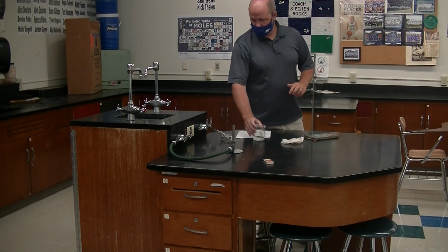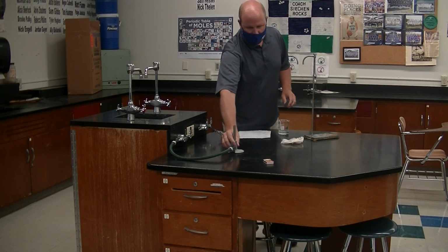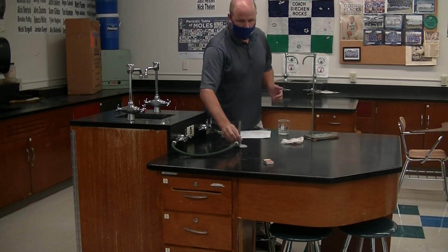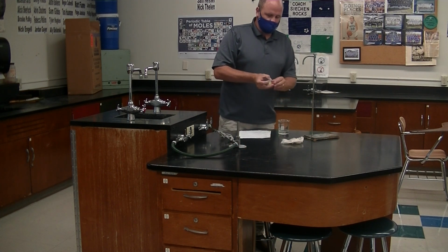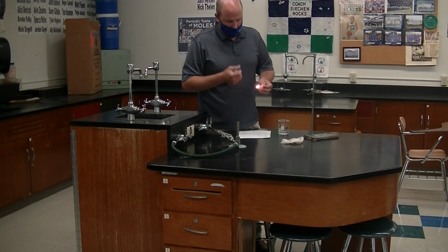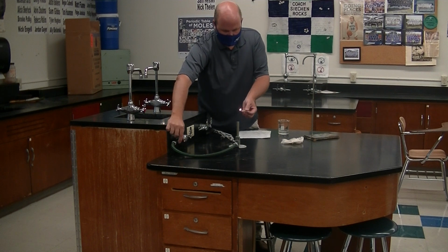All right, and then what's this called? A beaker. Have you ever seen one of these before? No? This is called a Bunsen burner, and this is our primary heat source. We will use hot plates at times, but lots of times we use Bunsen burners.